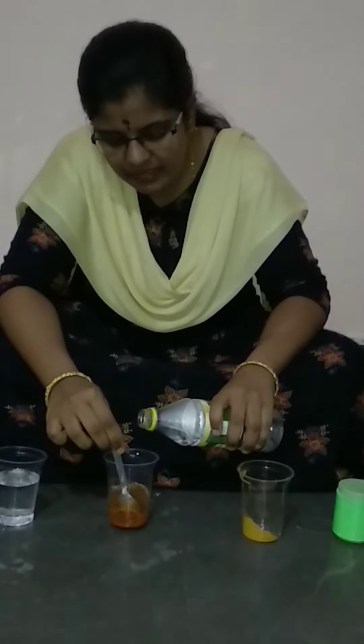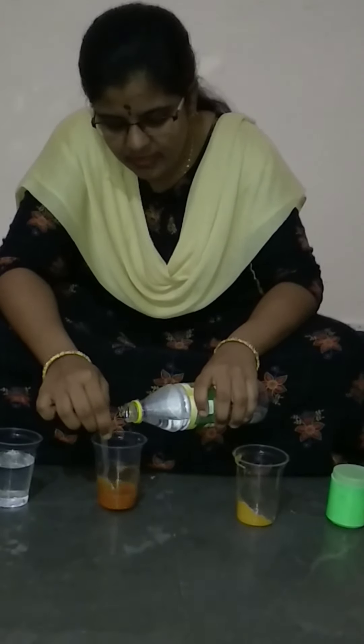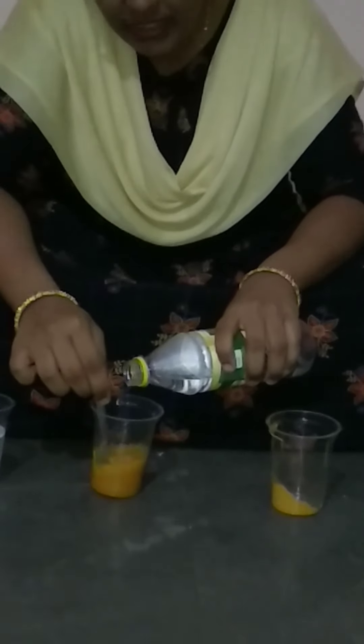Generally in labs they will be adding drop by drop, and here we will be adding some ml by ml because it is a weak acid. So slowly, slowly you can see that the red color is being lost and it is coming to yellow color.